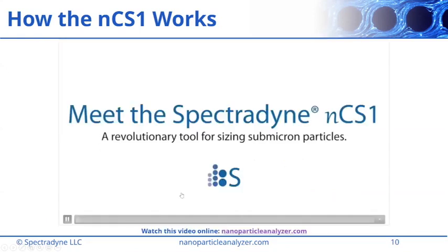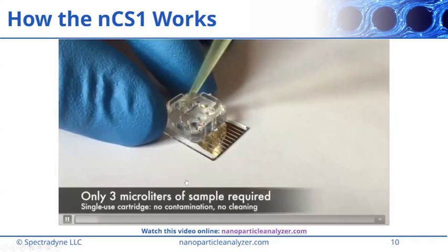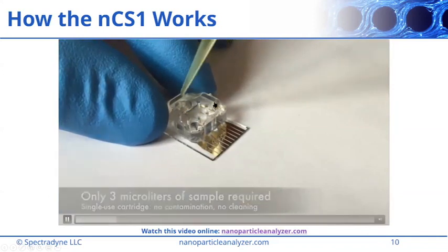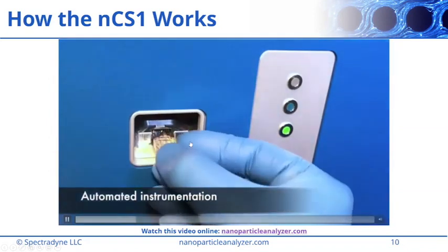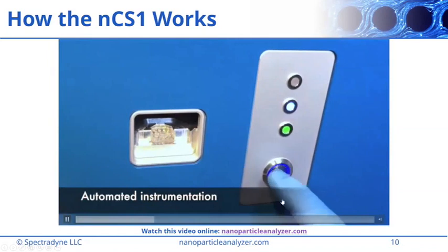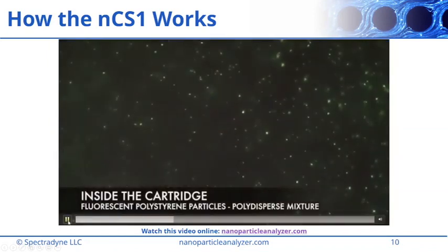I want to show you just a quick video here that gives an overview of using the instrument. It's kind of fun to watch too. Here's the user loading up 3 microliters into the cartridge. The cartridge goes in the instrument, and it's all a very automated process. After this point, the instrument is all software controlled.